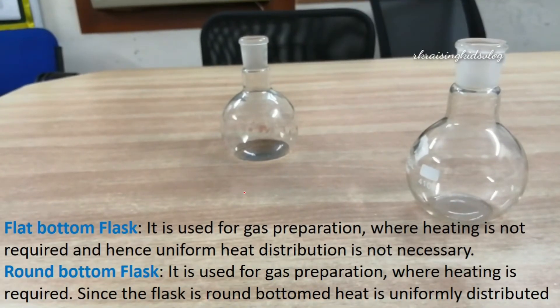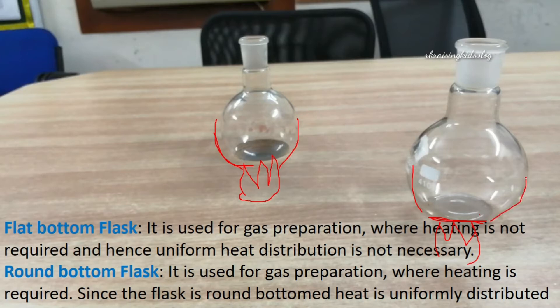Let's imagine there is a fire — we are applying heat to a liquid inside a round bottom flask. The heat would be uniformly distributed equally around the sides and the bottom since it's round. But if we heat a liquid in the flat bottom flask, the heat will be applied more at the bottom than at the sides.